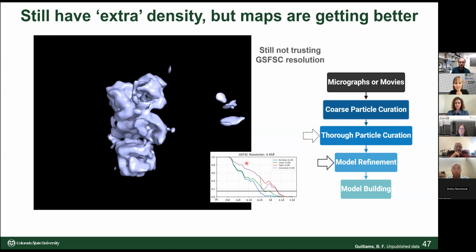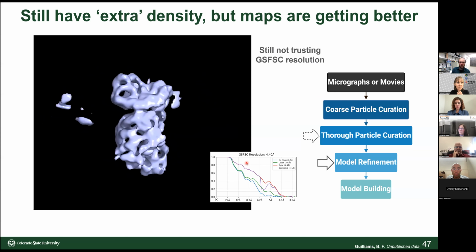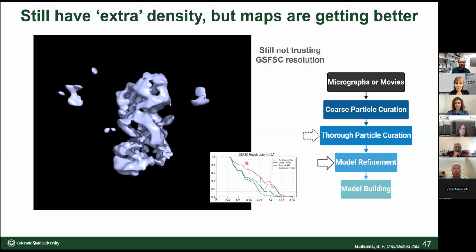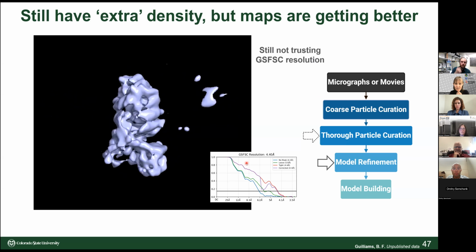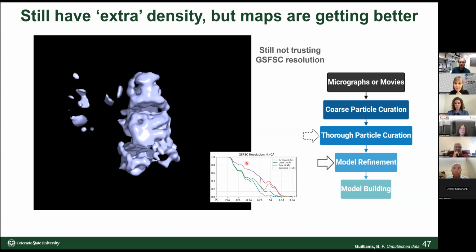Take the picture at defocus 0.1 micron, or whatever defocus you used. It would show up as something quite different, either much lower or much higher defocus than you had thought, because of this pixel size being different.